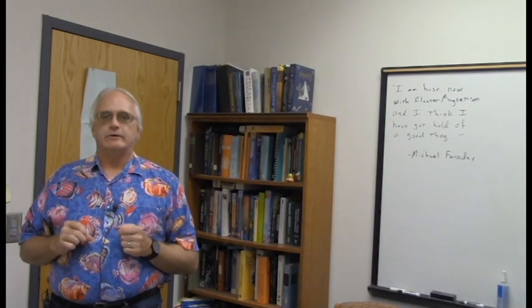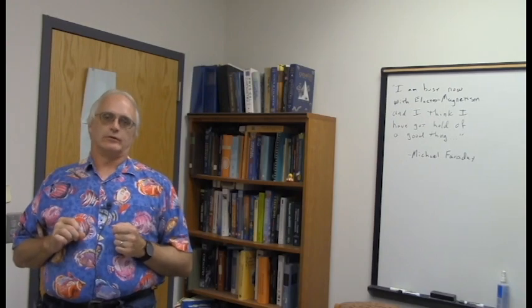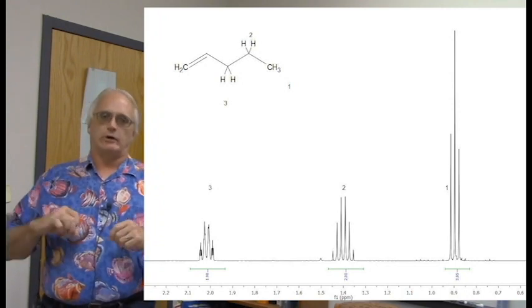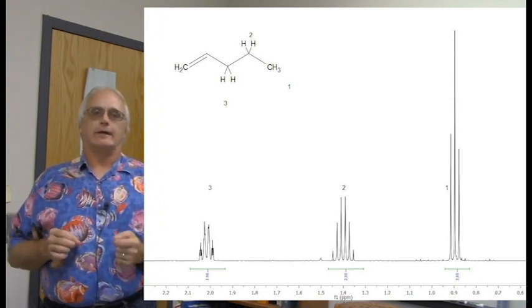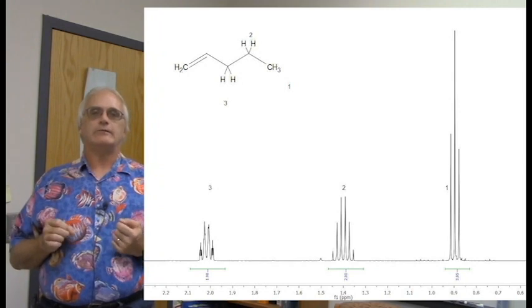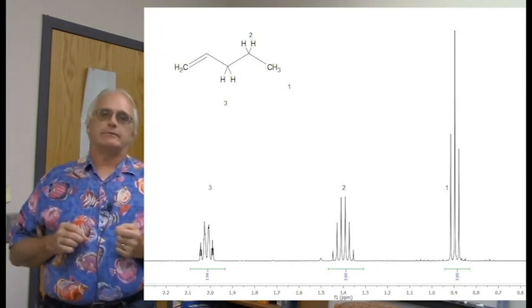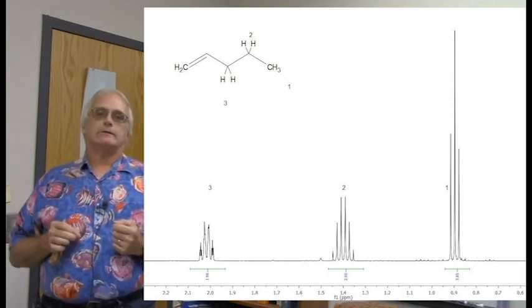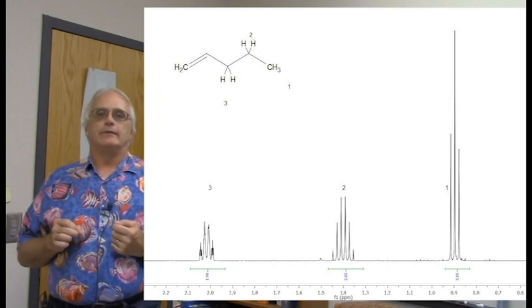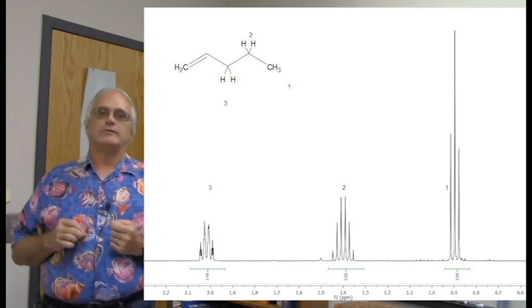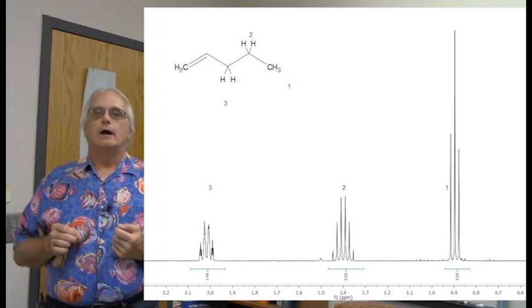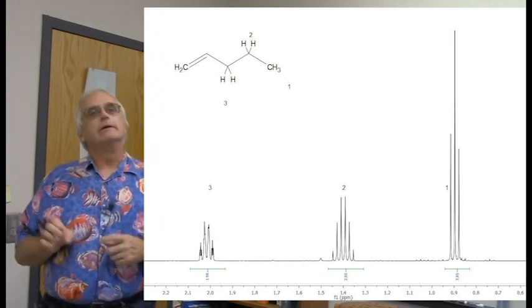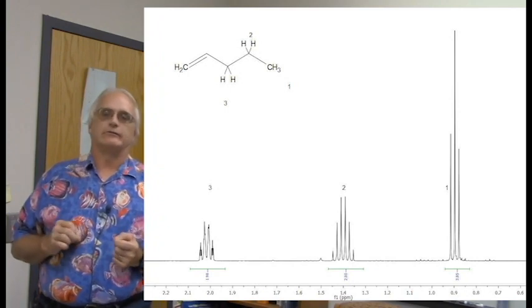So now we are going to focus in on the upfield side of the molecule for a moment. This area here, this CH3, CH2, CH2 section, all single bonds, all the chemical shifts 2 ppm or less. And if we focus in on that particular region, we see some lovely coupling patterns here. Now in the molecule, I've taken the structure and labeled the various three groups in here, just simply group 1, 2, and 3. When we focus on the alkene side, I'm going to use letters instead to try to keep it straight. Numbers for the upfield side, letters for the downfield side.